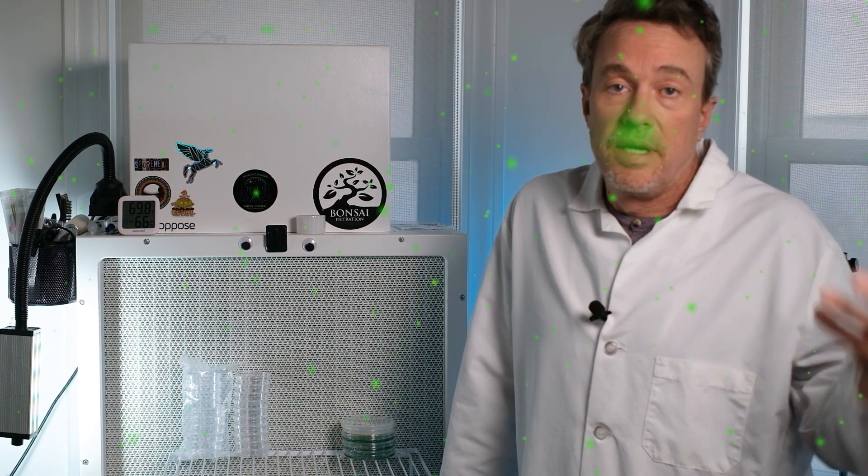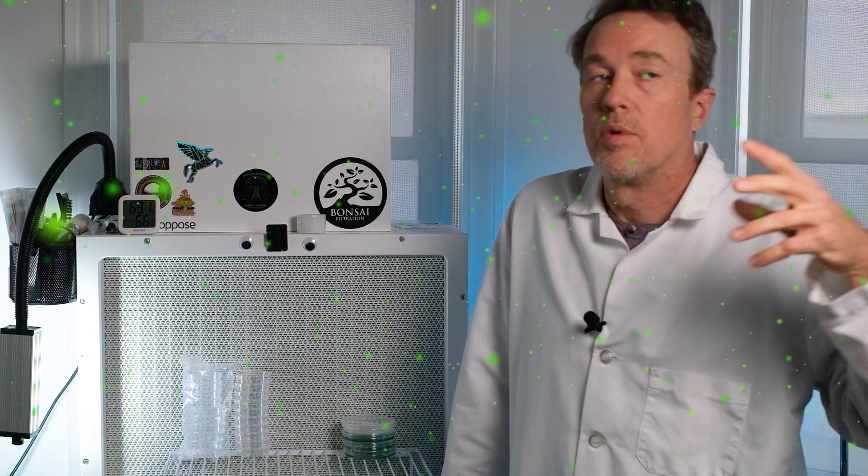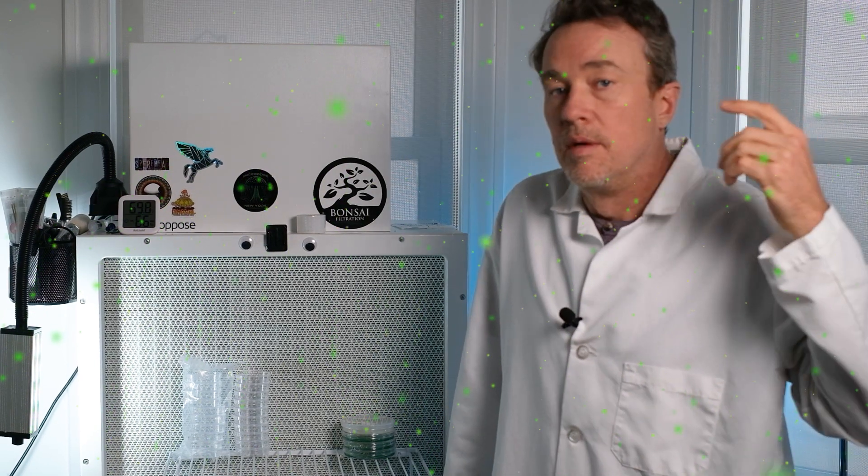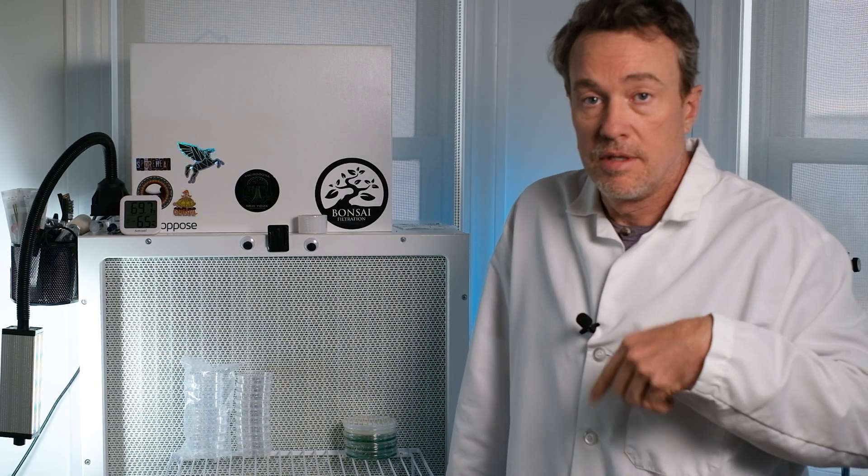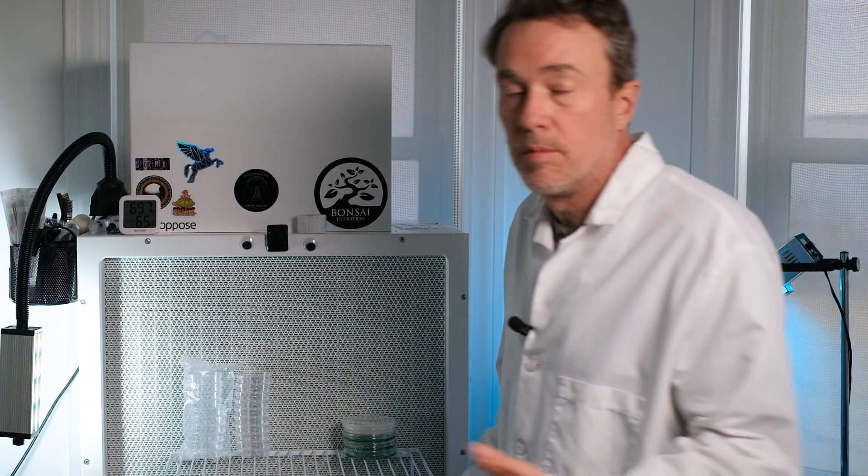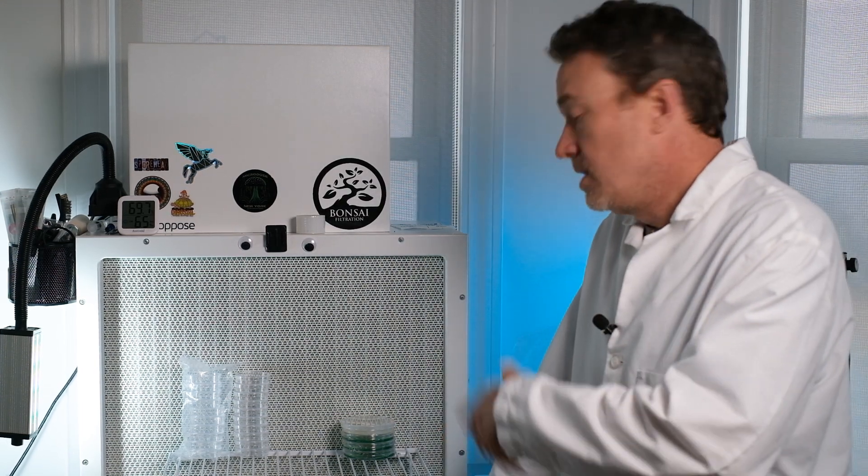Tip three is a big one that a lot of people don't think of, and that's your clothing and your hygiene. If you're coming into your clean workspace after being out all day, all the stuff from the day clings to you—pet dander, skin cells, mold spores, bacteria, mushroom spores from outside, all kinds of stuff. So take a quick shower, put on some clean clothes. I have a lab coat that I keep just for doing this stuff. It stays in a plastic bag when I'm not using it between cleanings. Just something to think about, because that stuff can easily fall right into your plate while you're working, and that's the last thing you want to do. You don't want to do all this prep and then contaminate half your plates because you forgot to change your shirt.